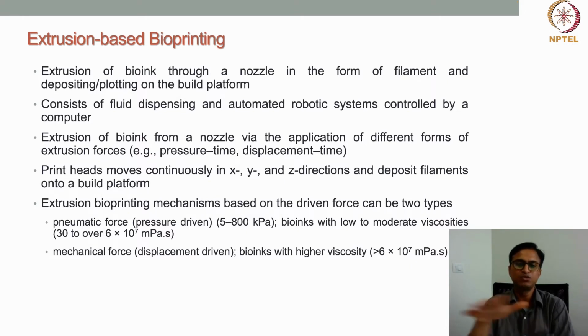Also, the print head can be of different types. Either the print head can move in XY, as I said, and in that system the build platform moves in Z. In certain cases, the print head can move in all XYZ directions. In certain other cases, the print head can be stationary, moving only in Z direction, and the build platform moves in XY direction. Any combination can work, but the most common type is where the print head moves in all three directions, XYZ, and the build platform is stationary.